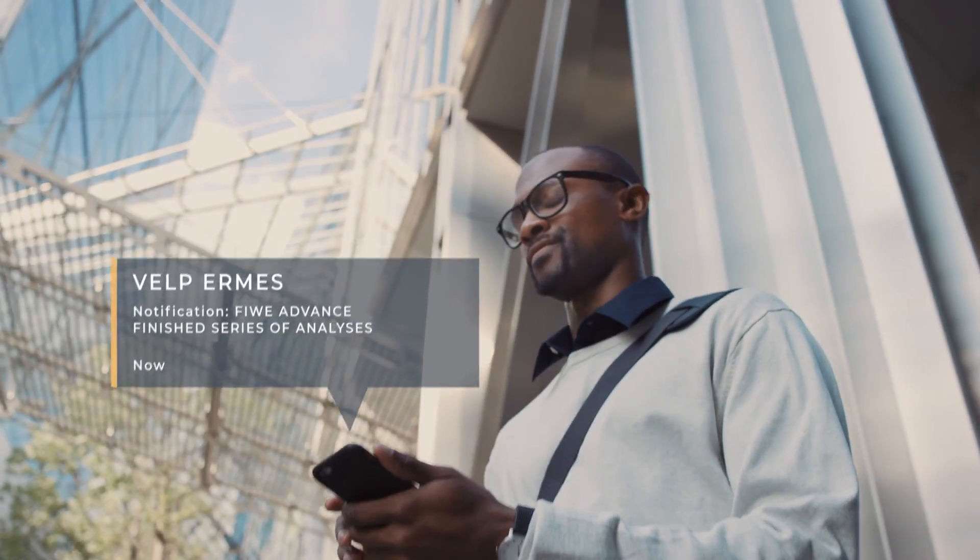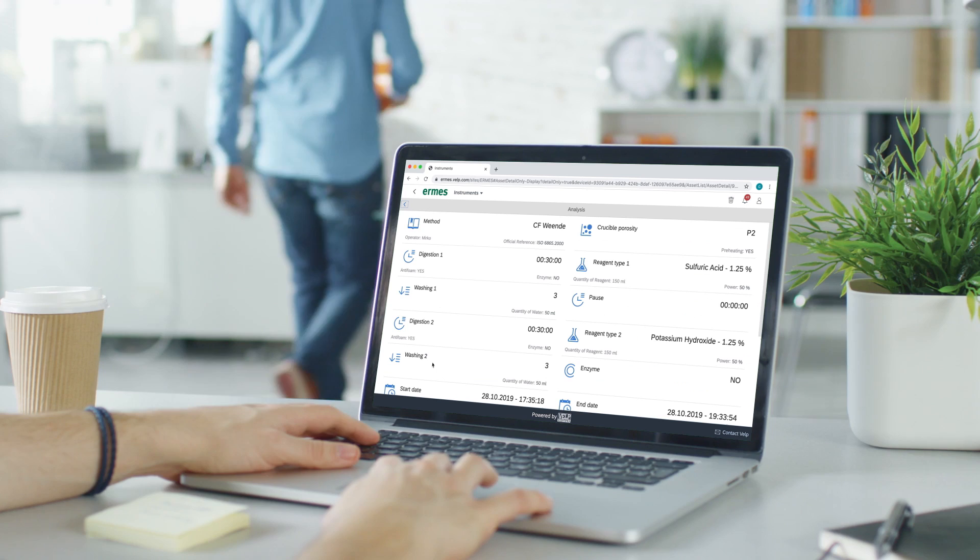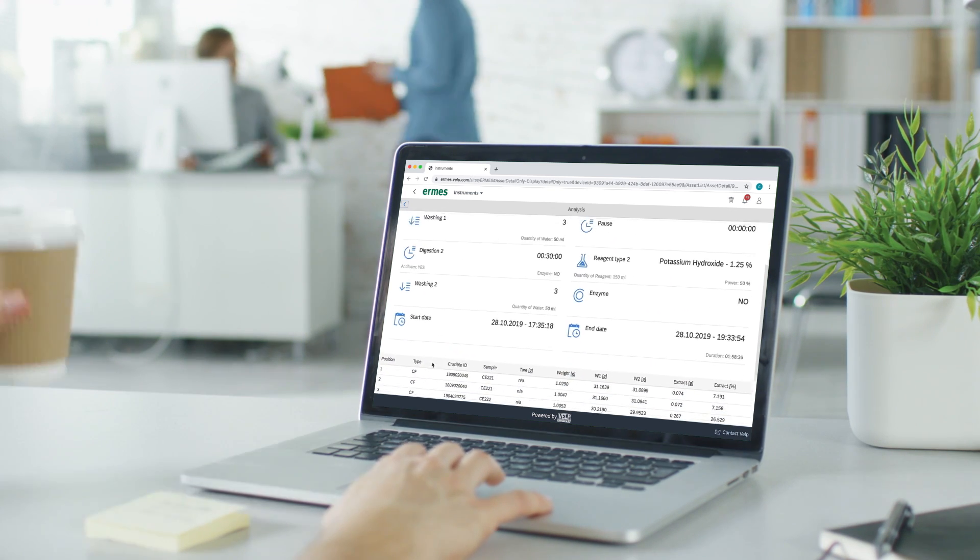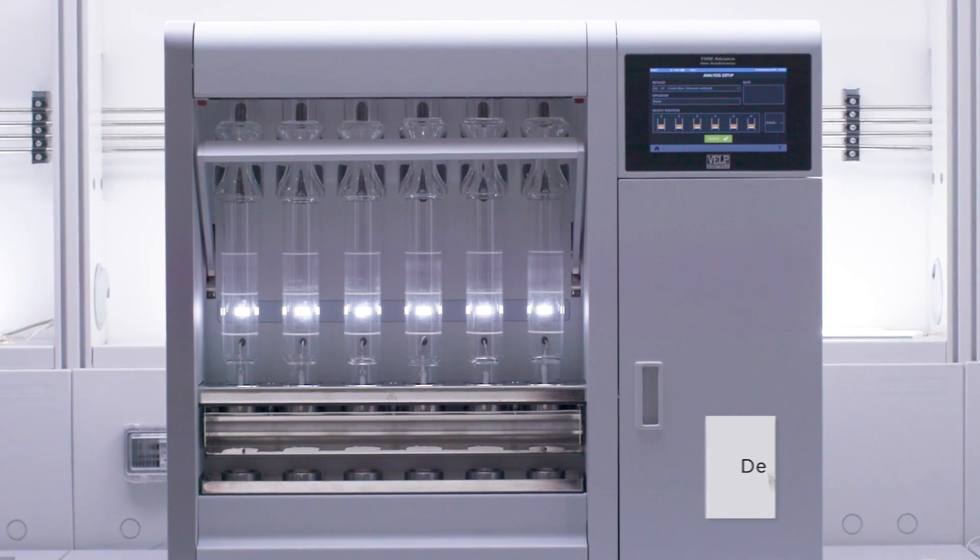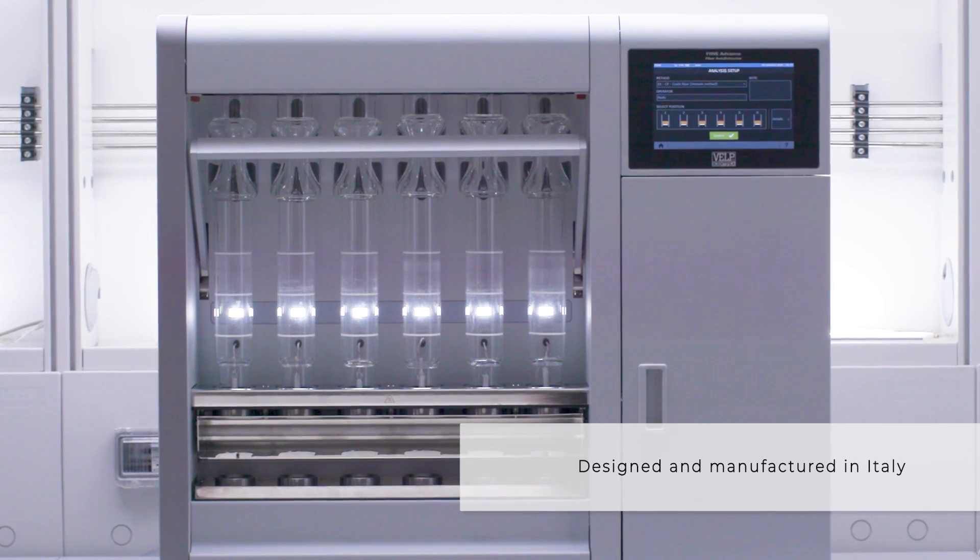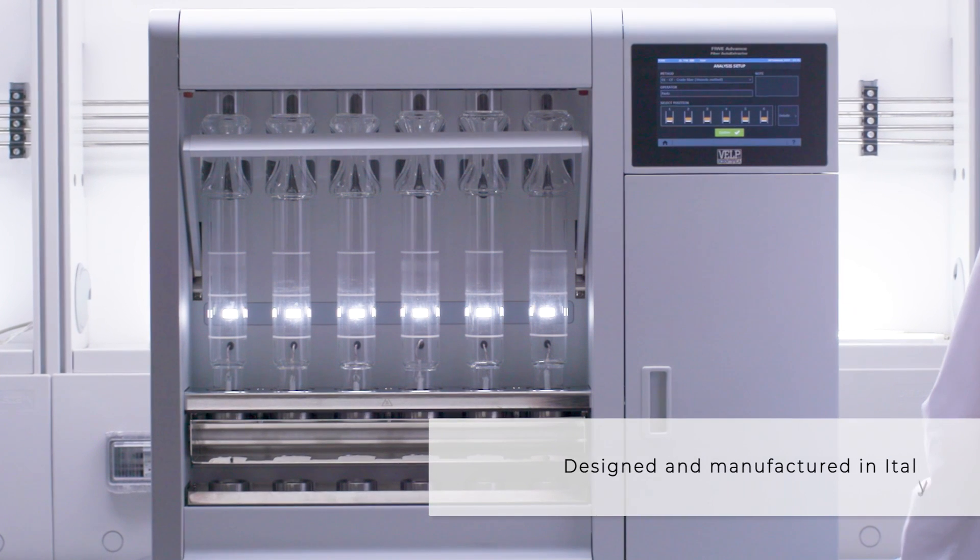The instrument is designed to adapt over time with regular software updates, introducing new features, functionality, and performance. Feeway Advance, the automatic fiber extractor designed around you.